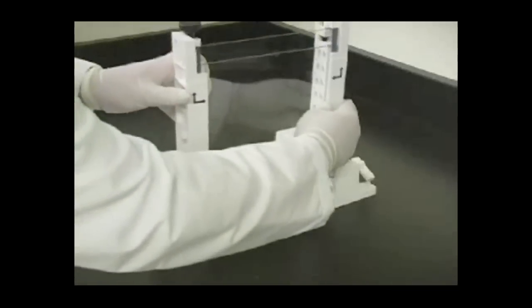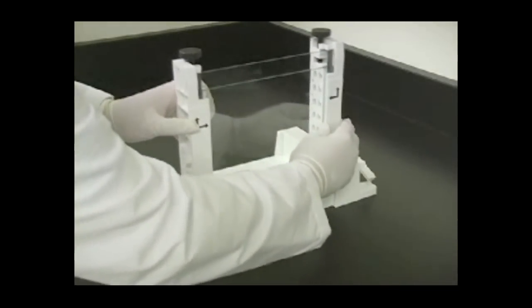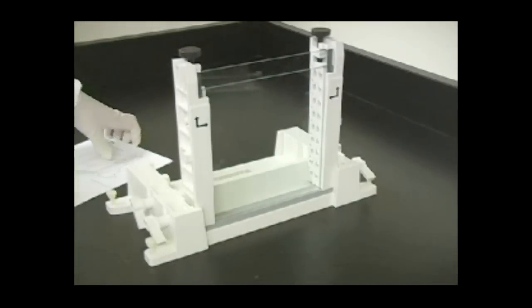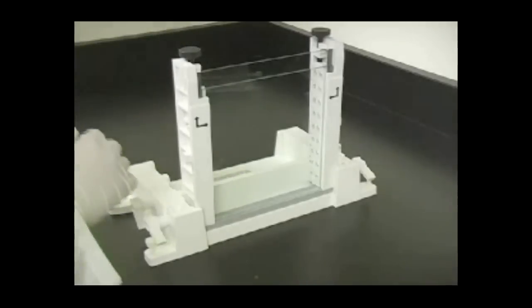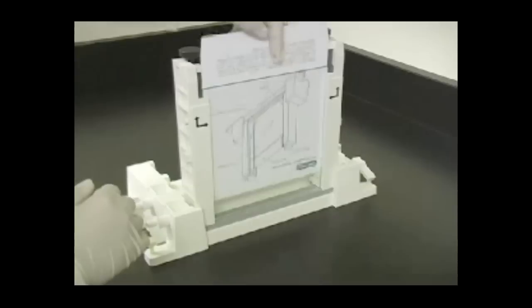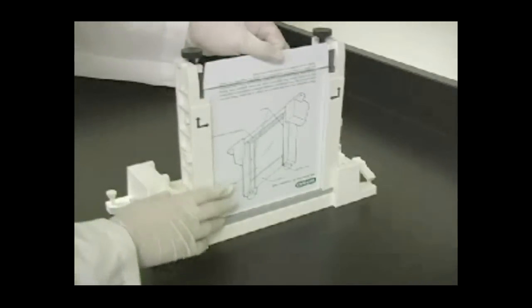Place the assembled gel sandwich in the slot on top of the foam gasket, short plate facing outwards. Insert an alignment card between the two glass plates to push the spacers to the extreme outer edges of the glass plates to ensure maximum gel width. You may need to slide the card from side to side to properly align the spacers.